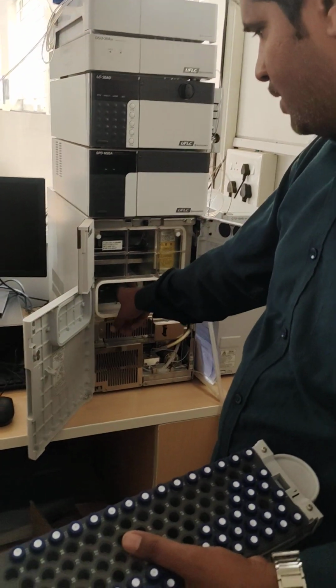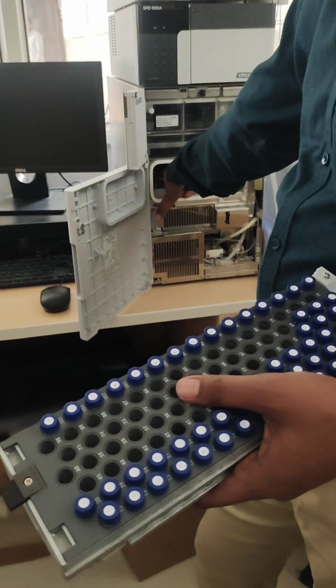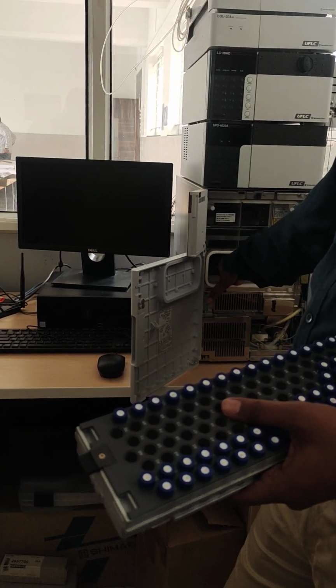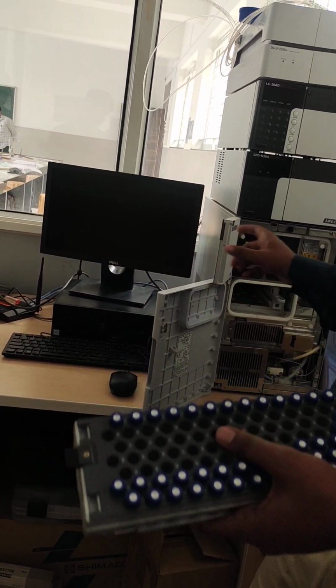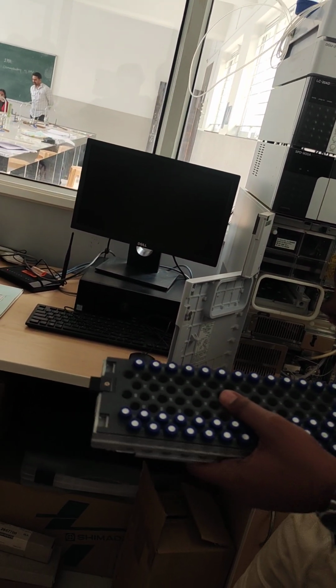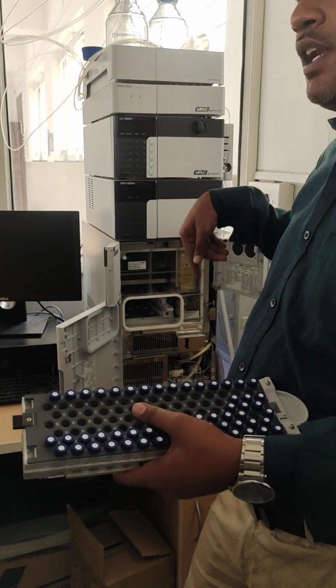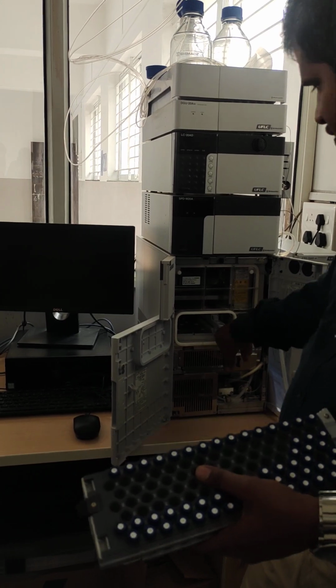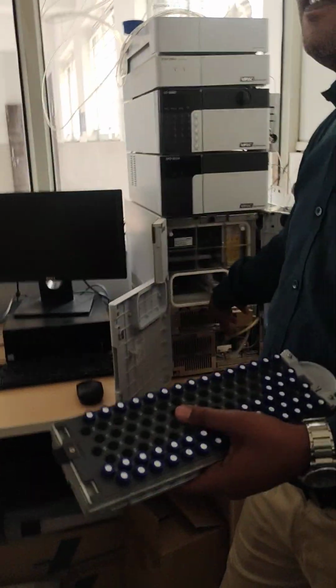There is a port available for the column here at the last, in the column compartment section. There we provide the sample with the help of this injector, and again it will rinse in the next section and come to the original position. Here it is, the original position. I will show you when it is working practically.